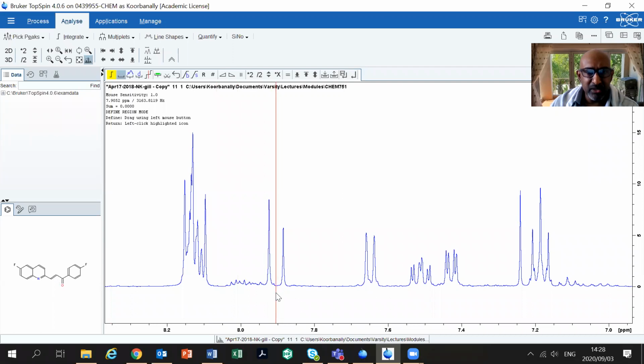And that's this here, but I know that intuitively. I'll show you just now how to calculate those types of things, those coupling constants and so forth. So that's probably 1 peak, and I know that I'm getting doublets in this aromatic ring, ortho coupling at 8 hertz and meta coupling at 3 hertz and so forth. But I'm going to concentrate on this particular resonance here.